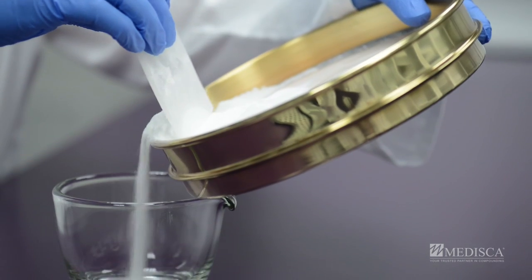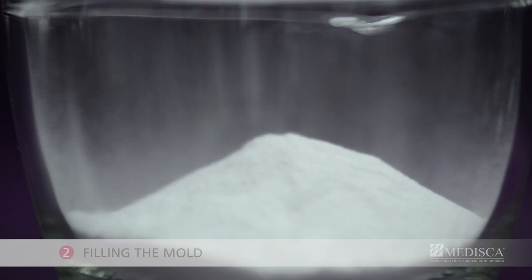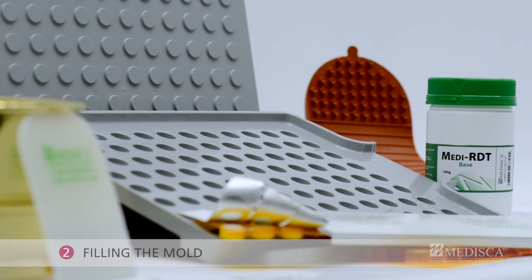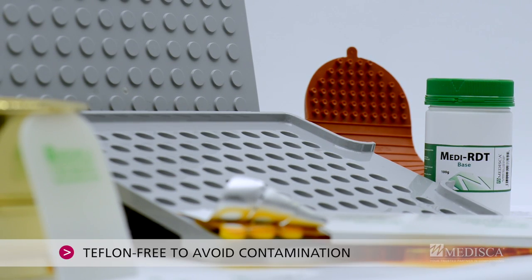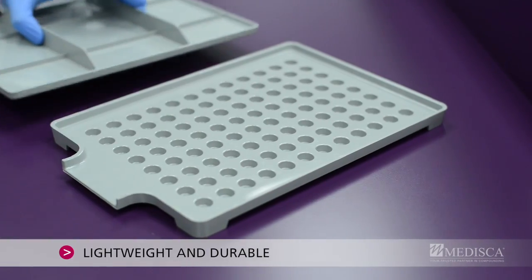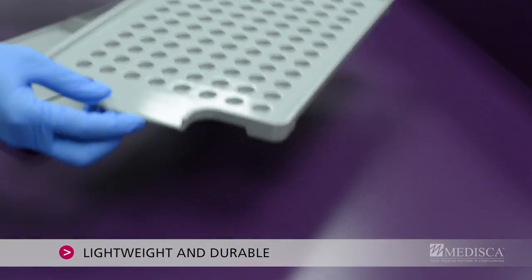Now combine to obtain a uniform mixture. Step 2: Filling the mold. Modiska's innovative Medi RDT molds are Teflon-free, made out of a unique heat resistant polymer, which also makes the mold lightweight and extremely easy to handle.